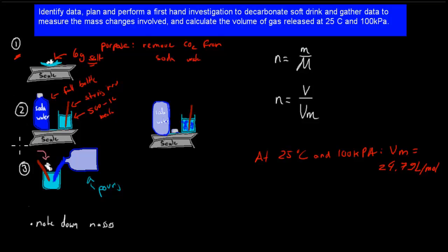And the reason why is because salt reduces solubility of carbon dioxide. So what that means is if we put in that salt, the carbon dioxide will leave faster, because right now it's dissolved. As soon as we put in the salt, it will just come out of the actual beaker faster. So you're going to see these bubbles which will be lost, and these bubbles are the carbon dioxide.